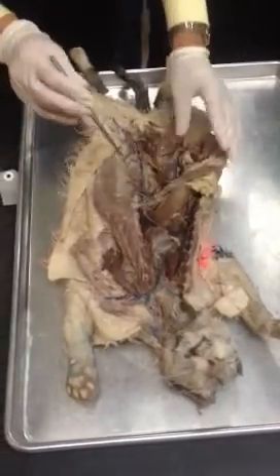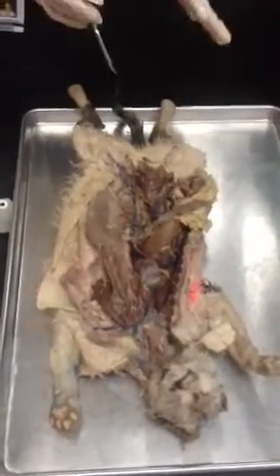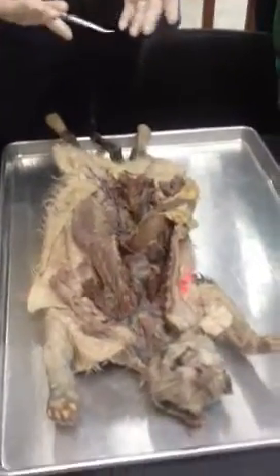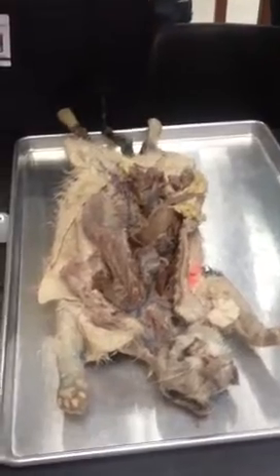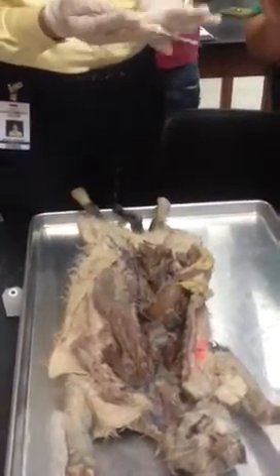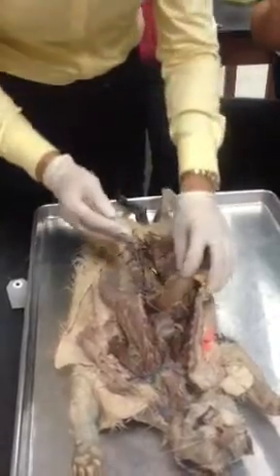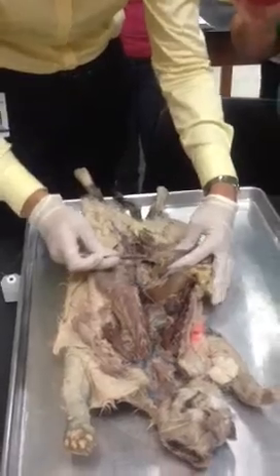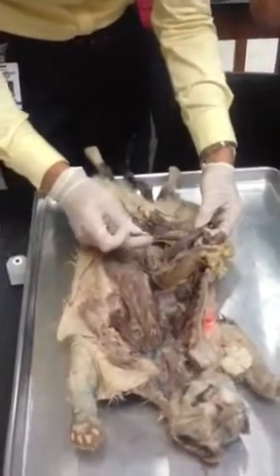Right? Now the blood flow from the viscera of the abdominal cavity, that way from like stomach, from spleen, from pancreas, from intestines, go into the portal system, and this is the triple injected cat. The way we see, this is the large intestine.